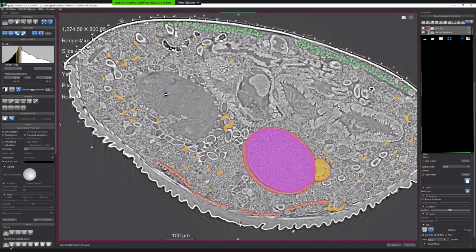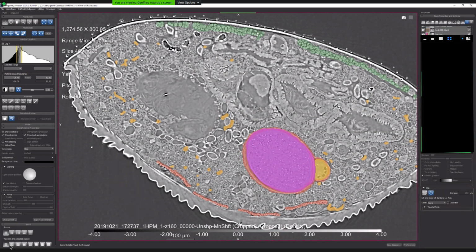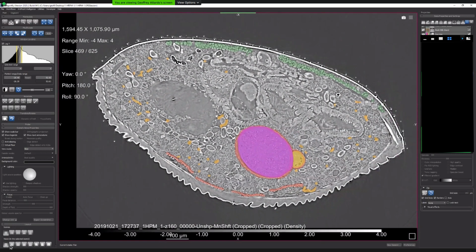Okay. And when you said you pulled out the 5 slices, did you use the marked slices? Yes. You have to select the original data set and switch to the image. Yeah, you're already in the image plane. You did this because you watched a video showing this? Yeah, I've been watching the tutorials on YouTube.